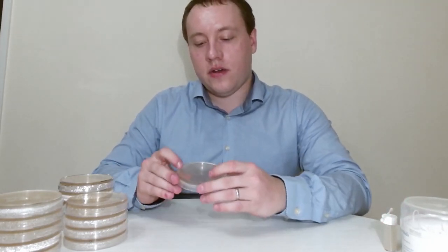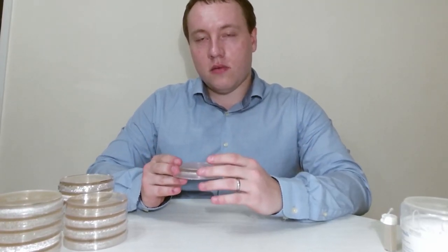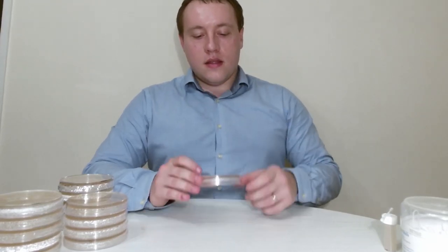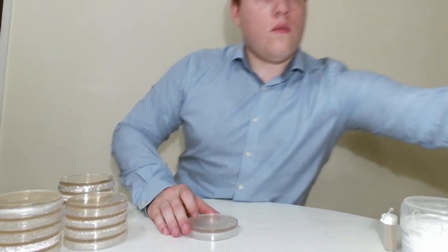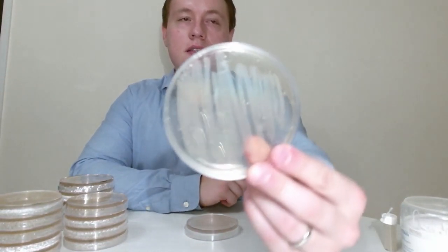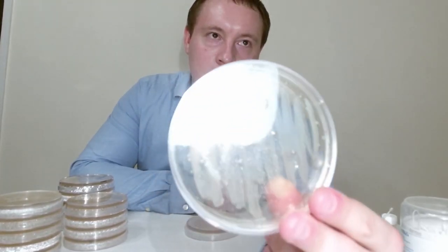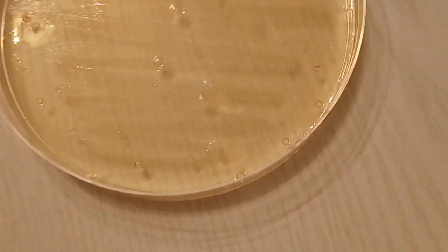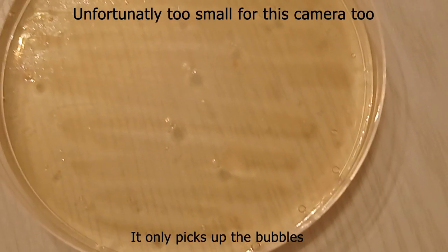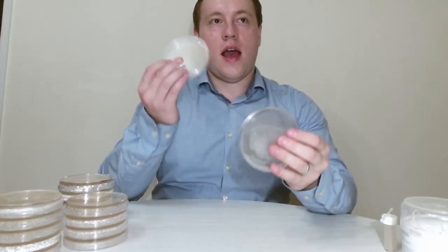Just to show you how much this will grow in one day at room temperature — I do have one extra plate that I made up last night, and that is how much growth you get in one day. You can't see too much about the individual cells here, so I'll get some b-roll footage of this and put it on screen so you can see how big the colonies are. In two days' time I'll show you how this plate looks and how this one looks.